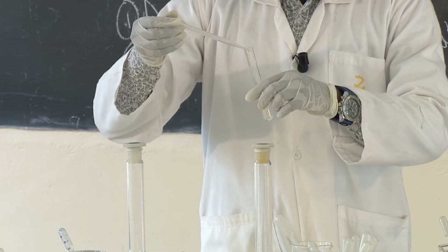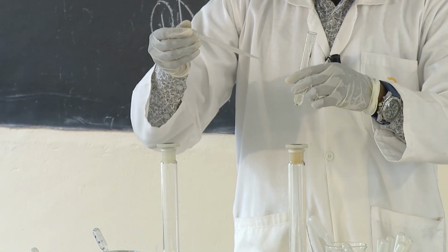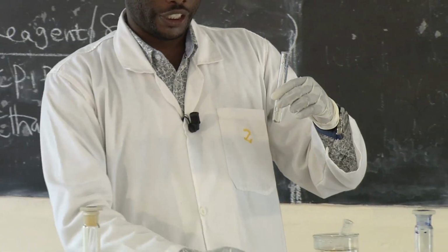Put it there. From there, you add water and you shake.